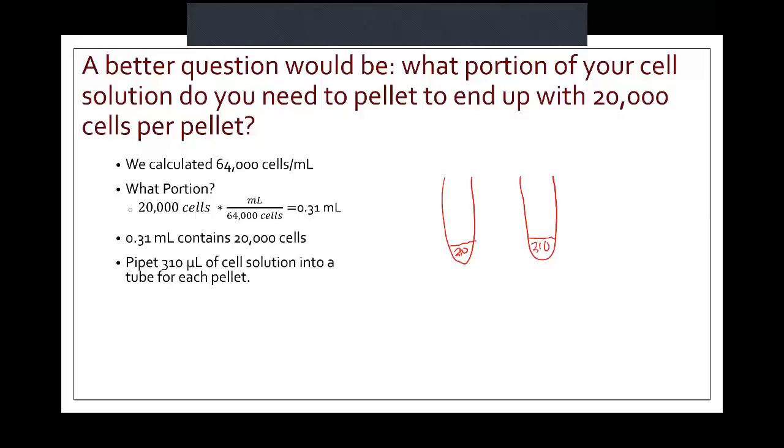You're going to put it in the centrifuge and you're going to end up with a cell pellet. Then you're going to take off this supernatant. The reason this step is important is because we're going to do the 10% condition and the 0.5% condition. To deactivate the trypsin, you're using this 10% media, but if you leave the 10% media on the cell pellet, then you're going to end up with a lot higher than 0.5% media, right?